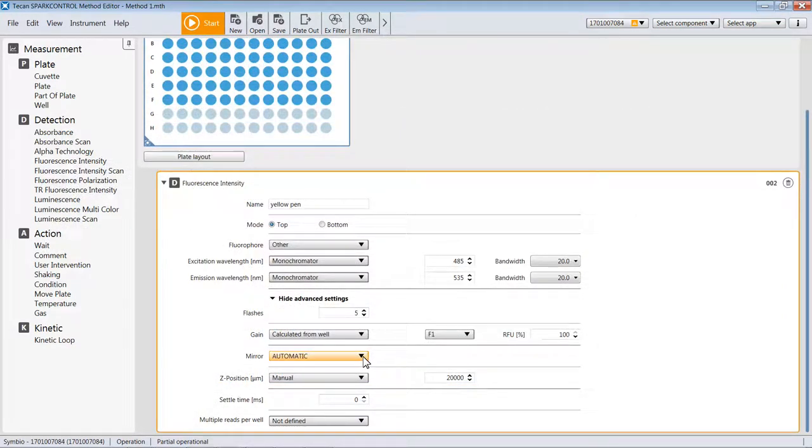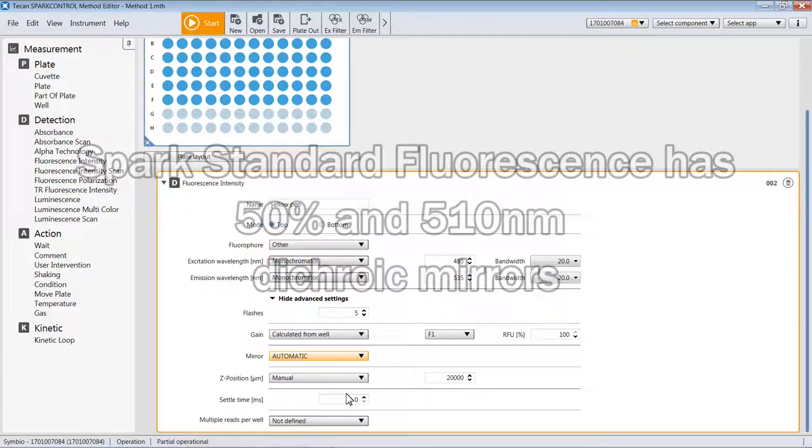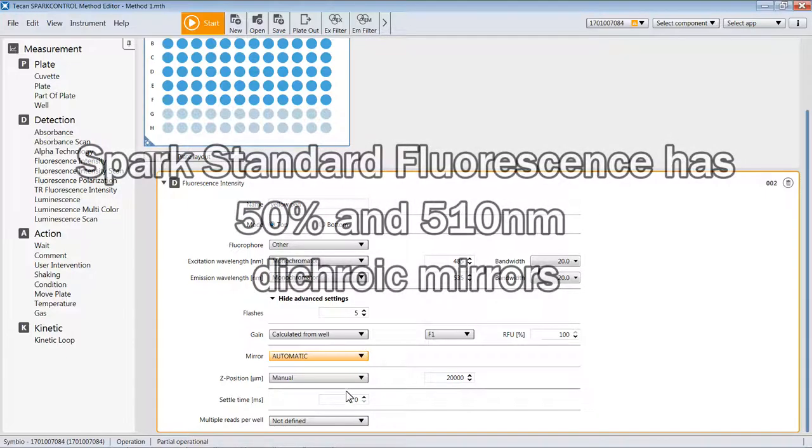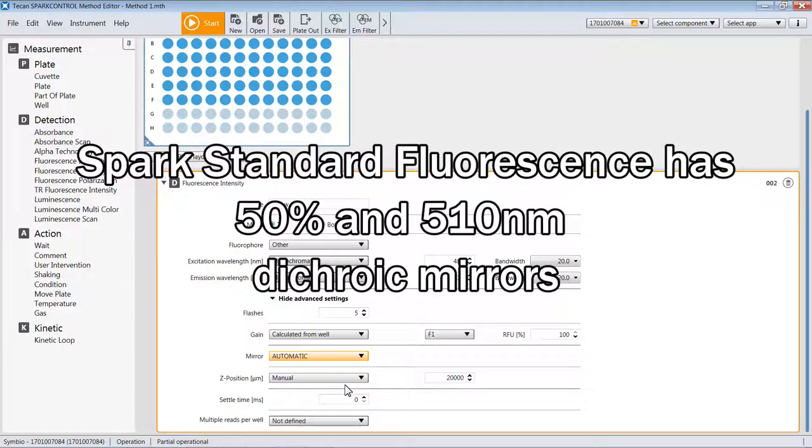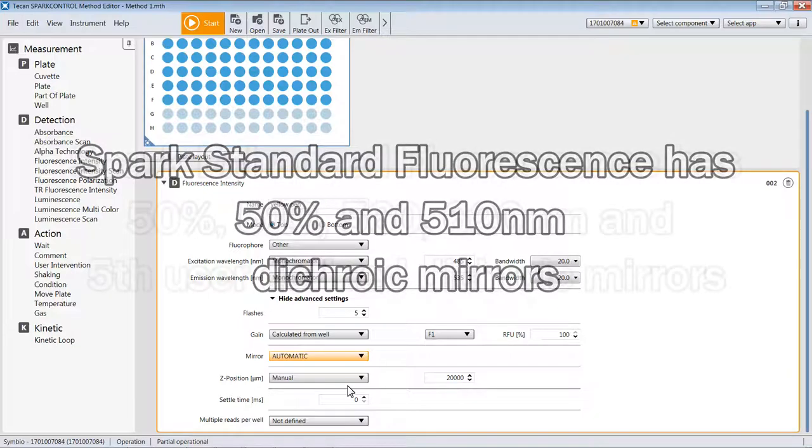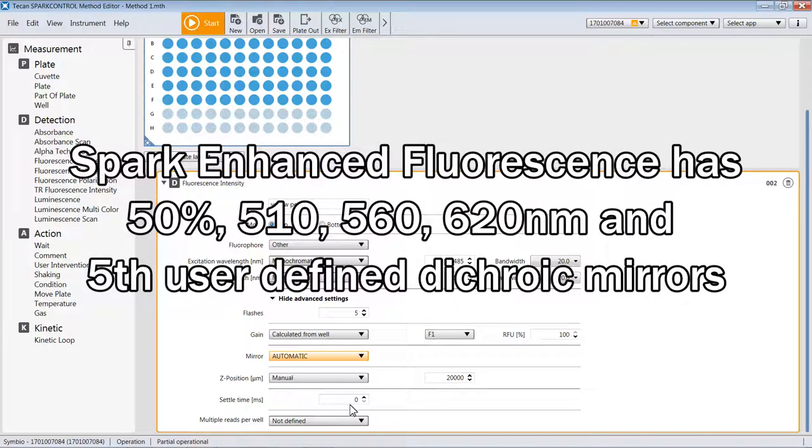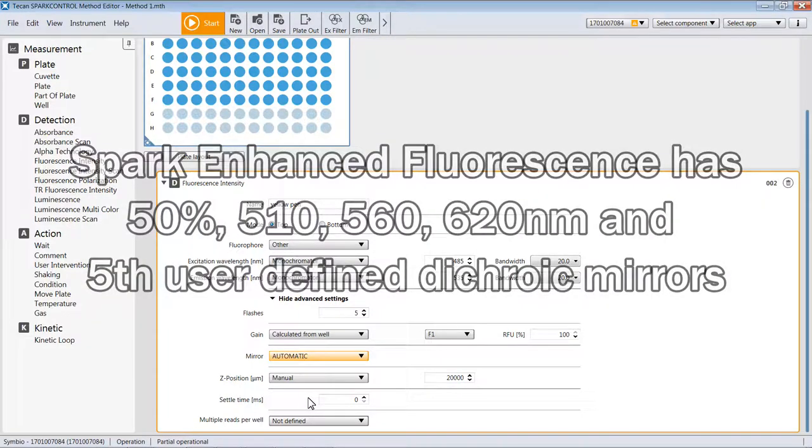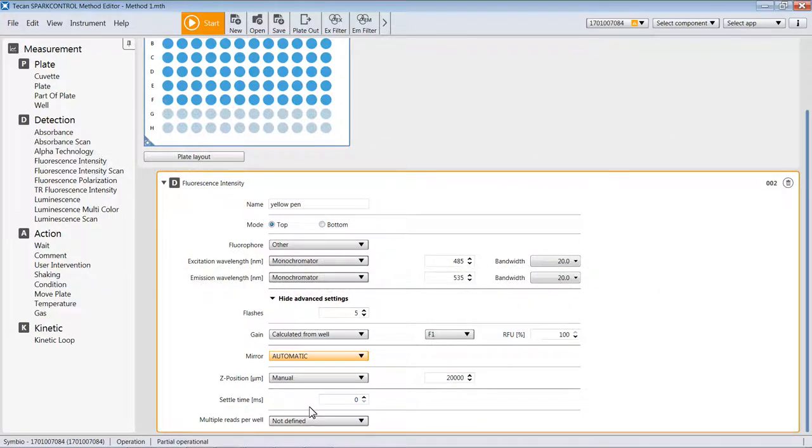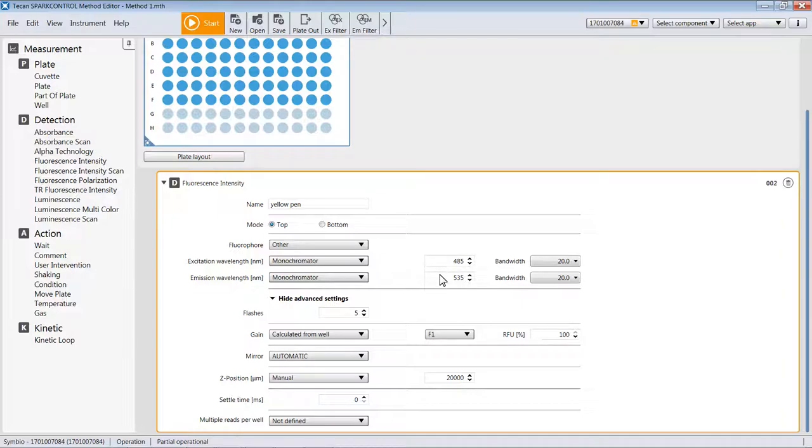On the Spark standard model, you will see that there's a choice of a 50% mirror and a 510 dichroic mirror. If you need an explanation of what dichroic mirrors are, please consult your TCAN manual or perhaps other videos. The standard model's got a 50% and a 510, whereas the model like this one with enhanced fluorescence optics has a choice of additional mirrors plus one user-defined mirror that you can insert and use to address other wavelengths within the range of the spectrum. For purposes of this example, I'm going to leave it out as automatic and let the reader decide which mirror to use for the wavelength settings that have been selected.